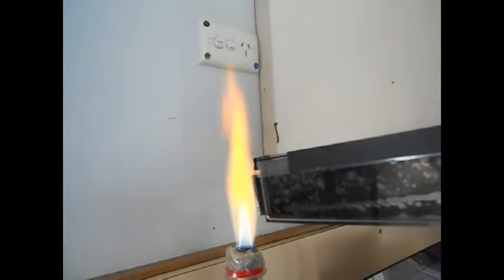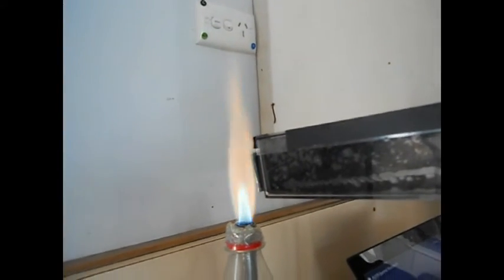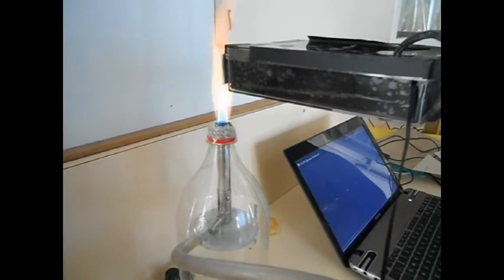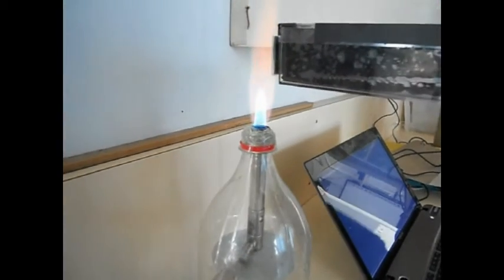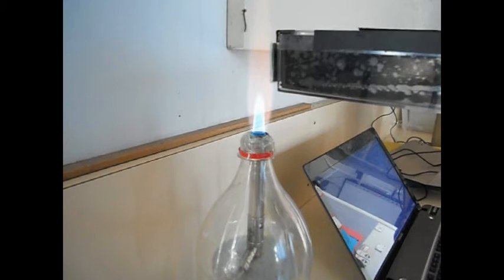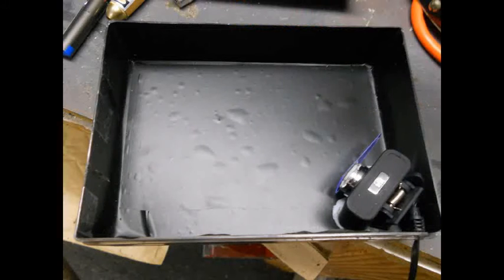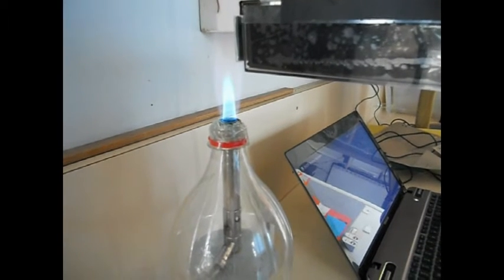In the future, I think we would refine the apparatus. We would use different bottles for different solutions to avoid the problem of sodium chloride persisting inside the Bunsen burner and interfering with other measurements. We would also play around with the size of the aperture in front of the camera to allow maximum light, as we had difficulty detecting the copper nitrate solution, for example.